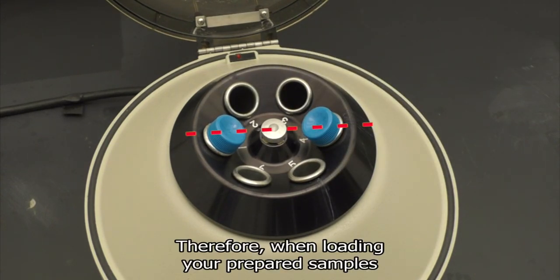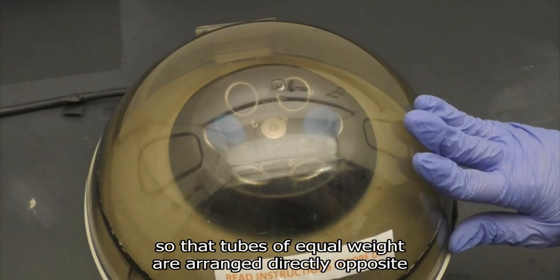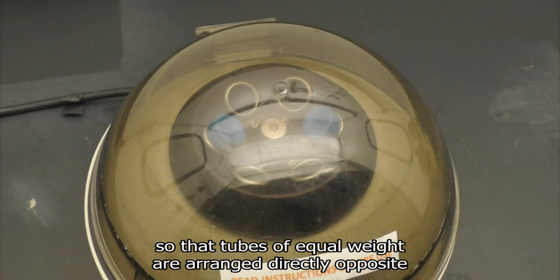Therefore, when loading your prepared samples into the centrifuge, open the lid and load the rotor such that tubes of equal weight are arranged directly opposite one another.